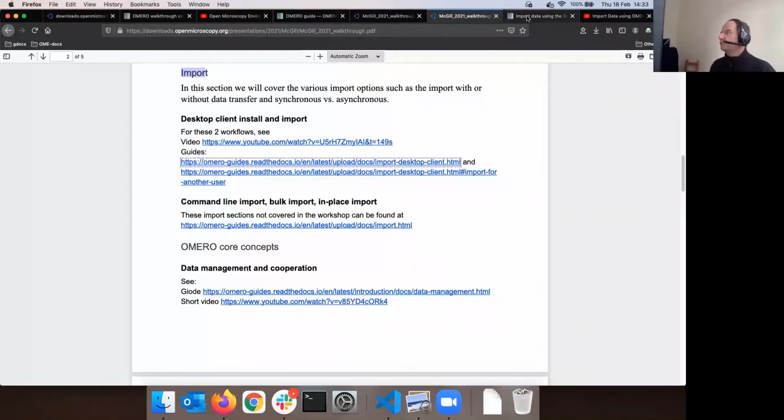I will try to mock install OMERO.insight for you so that, if you kind of got lost during the install, that's the moment where to start asking questions, okay?